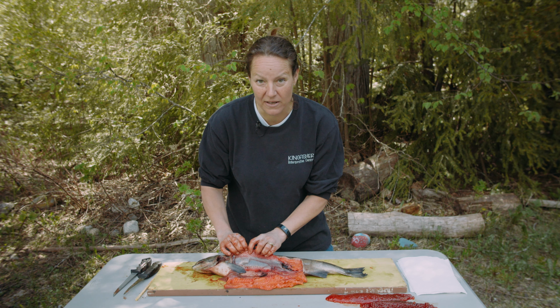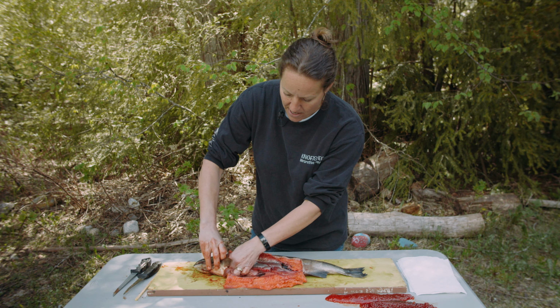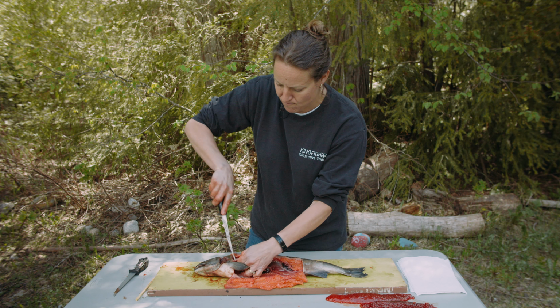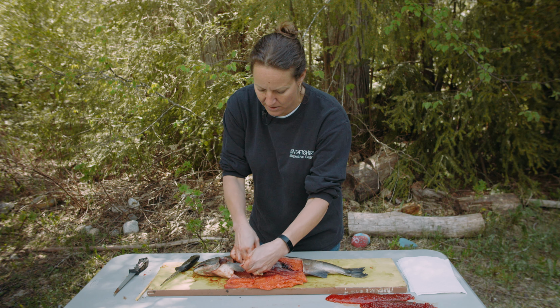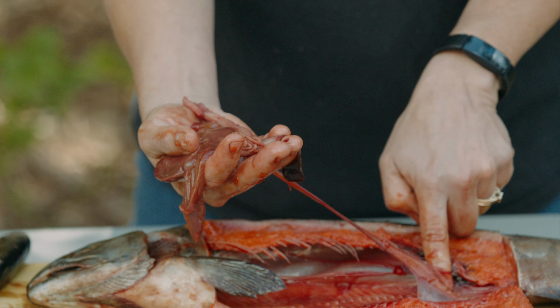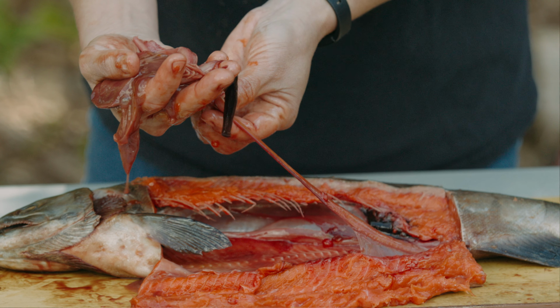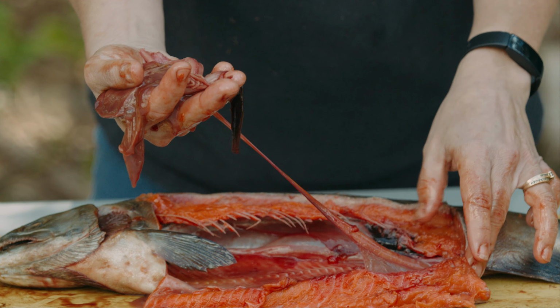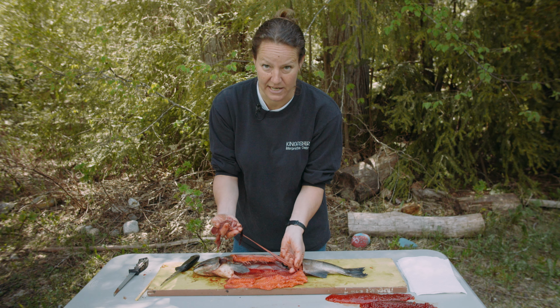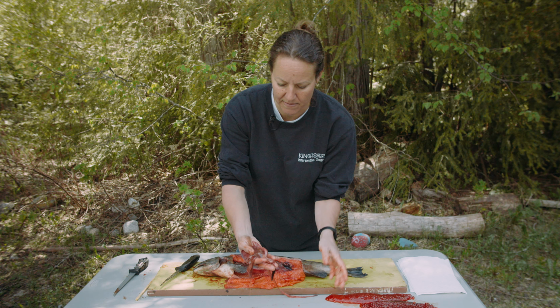Okay, now let's have a look at the rest of the digestive system because there are some other parts we need to learn about. So I'm just going to pinch it off. I'm going to cut it out and we'll look at the different bits. So as I pull it out, we can see that this digestive system is connected all the way down here to the vent. So all the excess food that doesn't get digested will be released through the vent. All right. And this part here, boys and girls, is the large intestine, just like we have. So let me just remove that and we can look at the different parts.